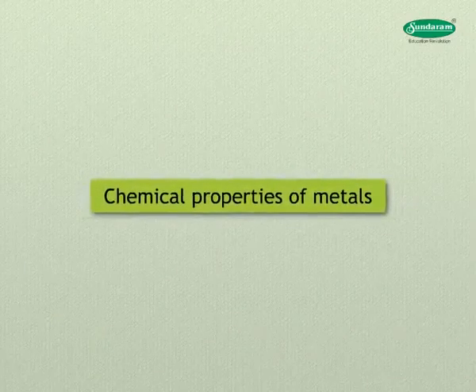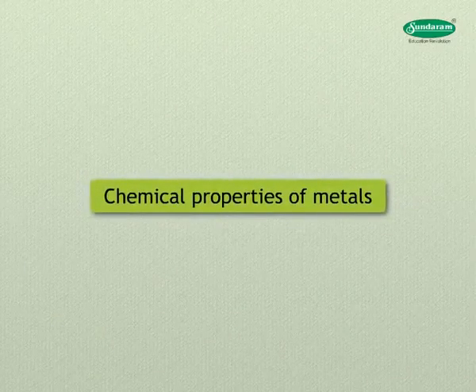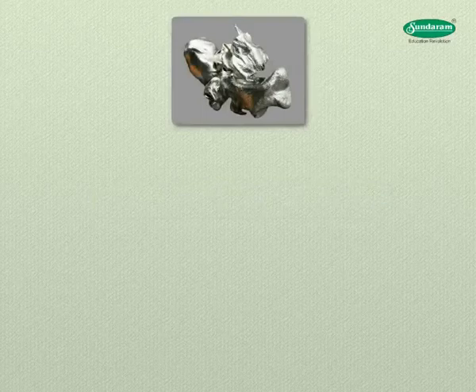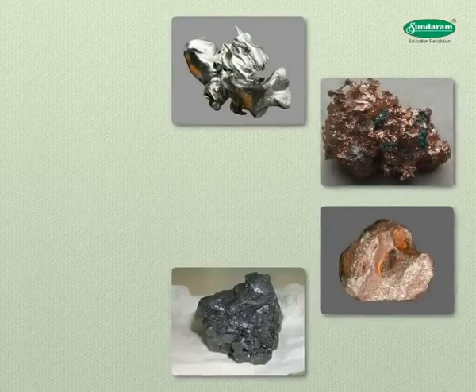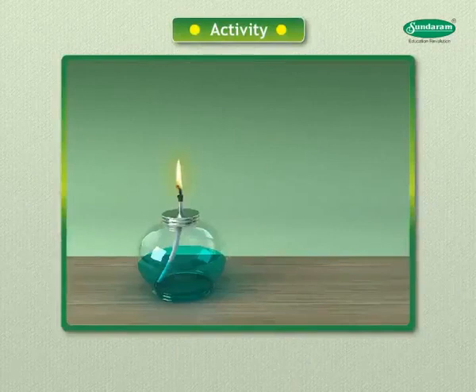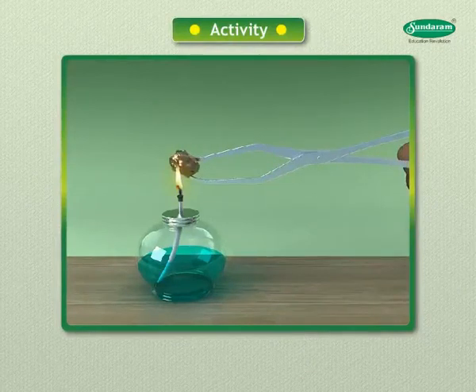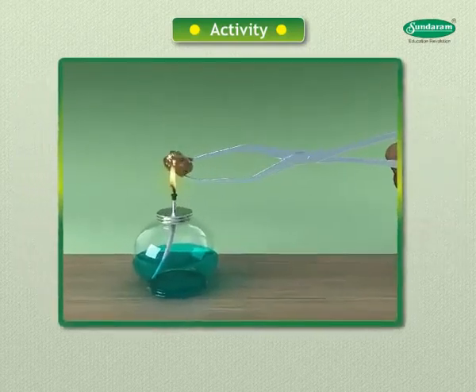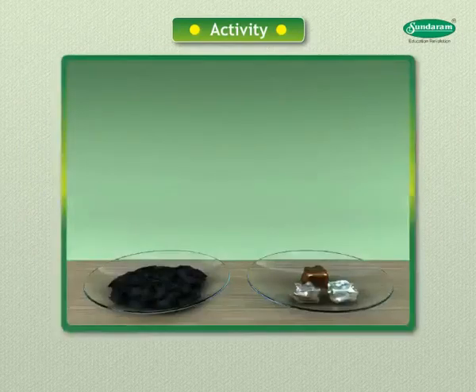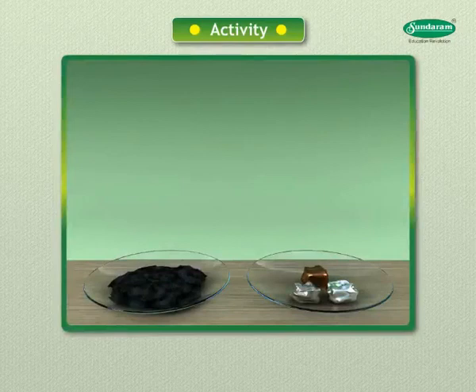Now let us move on to the chemical properties of metals. To learn about the chemical properties of metals, take samples of aluminium, copper, iron, lead, magnesium, zinc, and sodium. Hold any of the samples with a pair of tongs and burn over a flame. Repeat with the other metal samples except sodium. Collect the product formed.